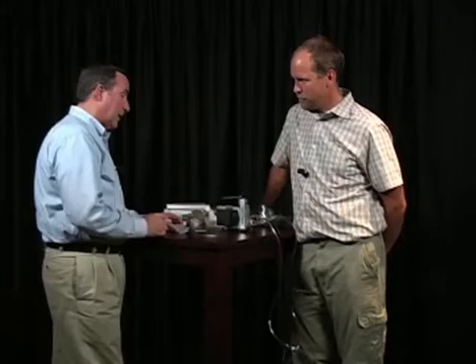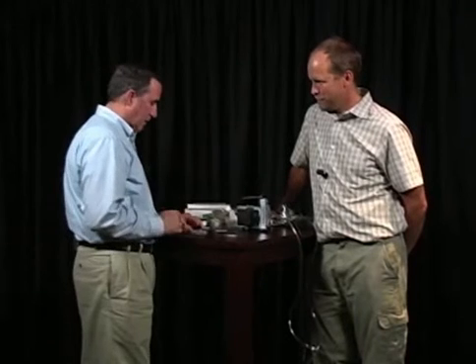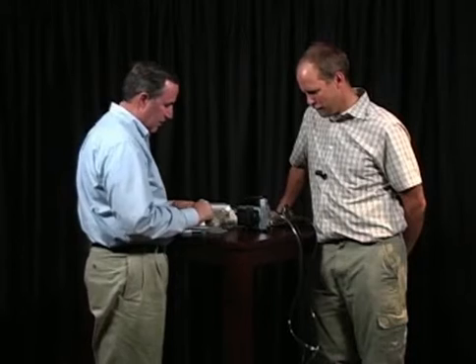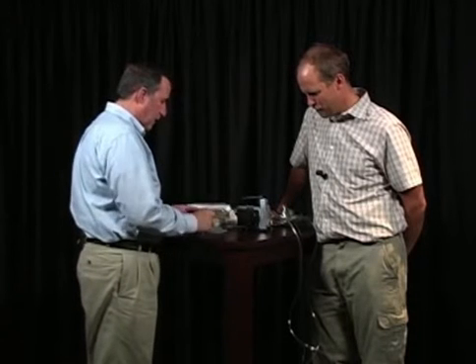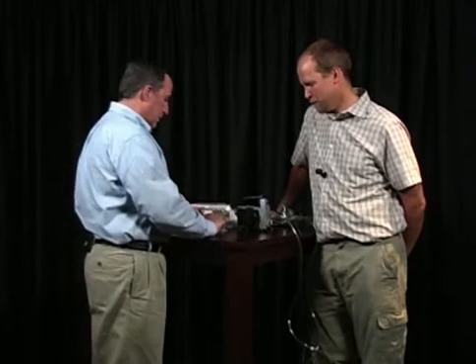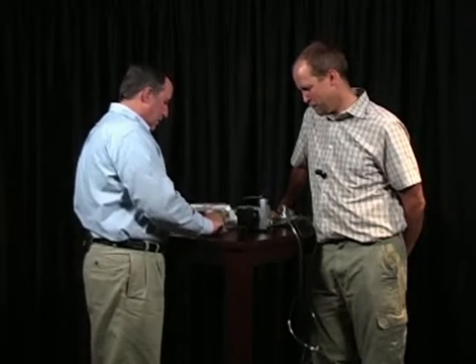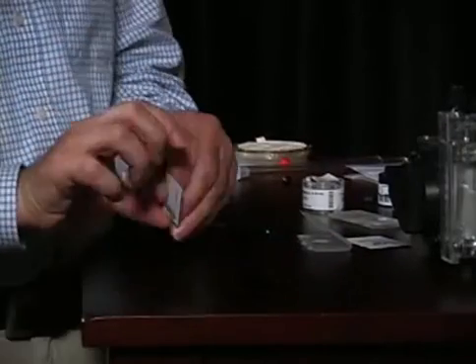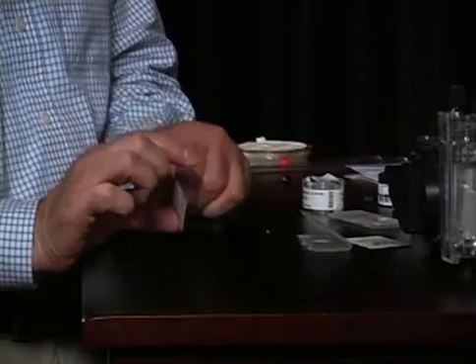always a good idea to label the lid and the base, so if the two get separated, they can always go back together. But as you label it, you want to peel this off, and you want to put it somewhere where you're going to be able to get it again. Now, I don't recommend that you carry it with you while you're sampling the surface, because it's going to get contaminated. So you want to place it in your pack like this, and this is meant to bend so that you can get to a surface and be able to pick it off.